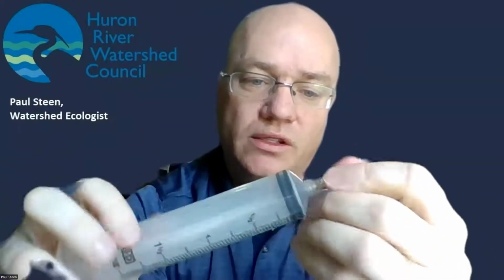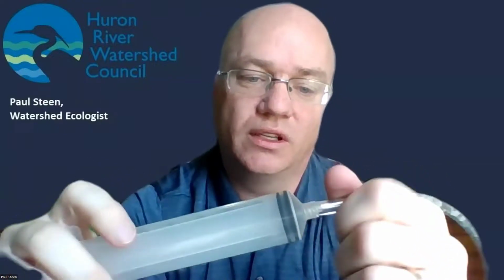You just have to push and twist and ream it on there good so it's a nice tight seal, but the threading actually on there, it's not designed to particularly thread in. All right, so you can see, I know I'm going in and out a little bit with my background, but yeah, you can see that works.